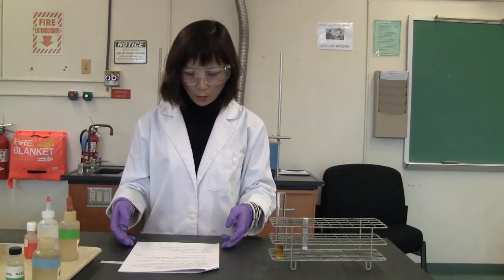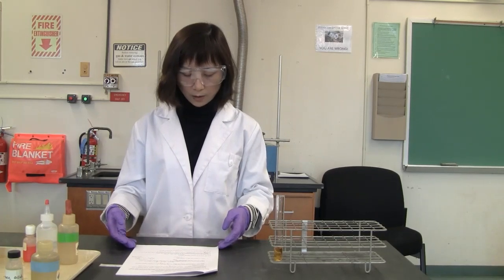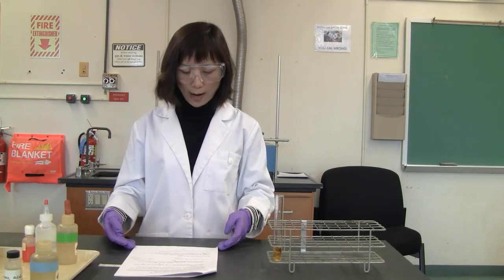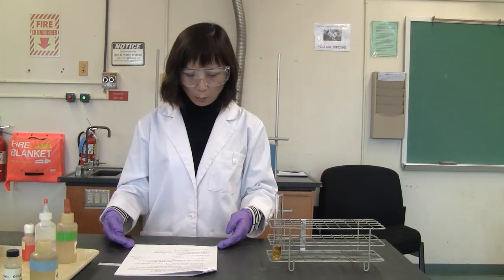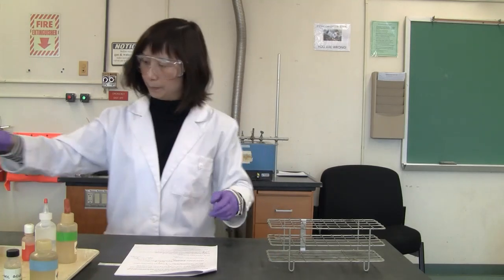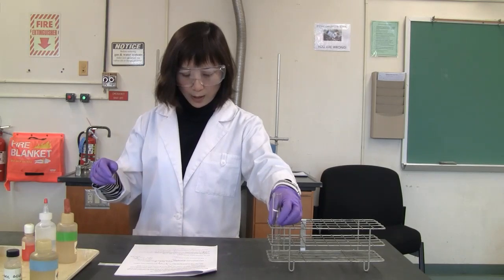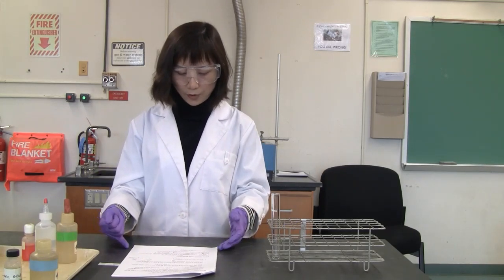So question 4, what ion caused the shift in the equilibrium? Make sure you figure out the ion, not the whole molecule. Now move to part 3, saturated sodium chloride solution. We are going to look at the saturated solution in an equilibrium and how we can shift the equilibrium.